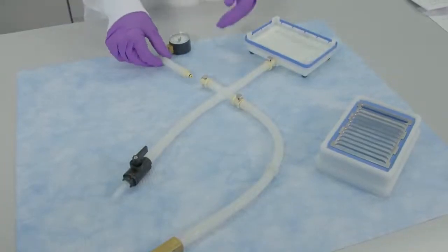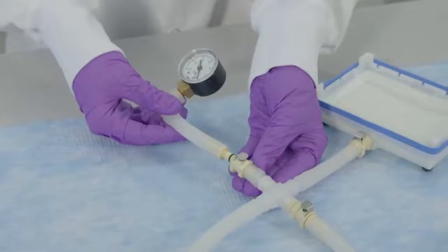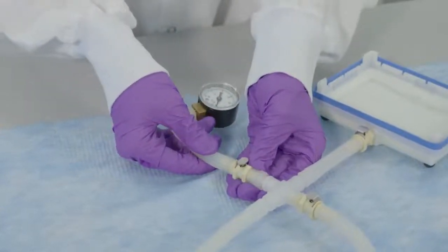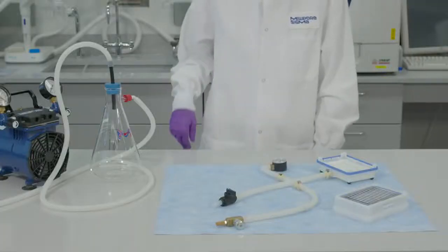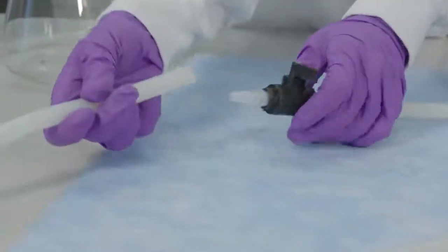Push the coupling insert on the end of the vacuum gauge tubing into the quick disconnect fitting on the longer arm of the four-way connector. Then you need to connect the vacuum source to the vacuum manifold using the tubing provided.